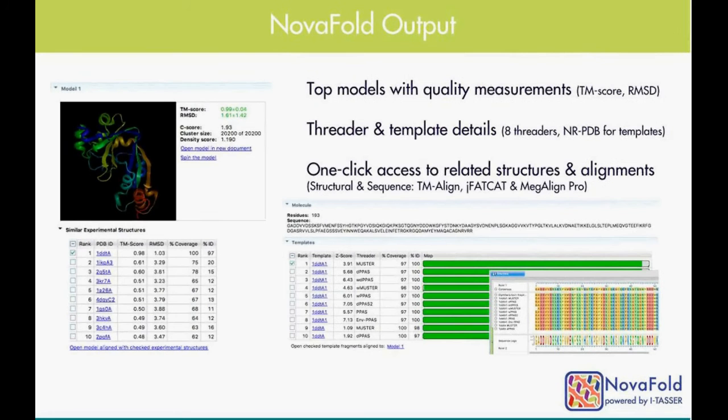So speaking of results, here is kind of the start of the overview of what to expect from the NovaFold tile that is generated after a structure prediction. In this report, you're provided a great deal of information about the prediction itself, the templates used throughout the modeling process, and provides really easy and straightforward access to features within the LaserGene suite of applications.